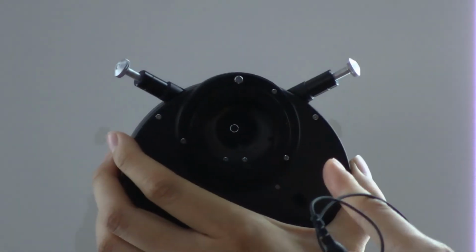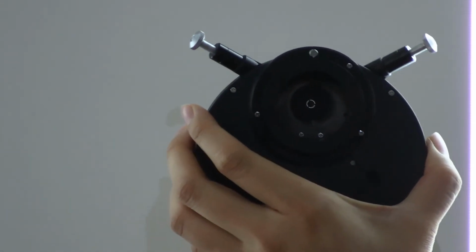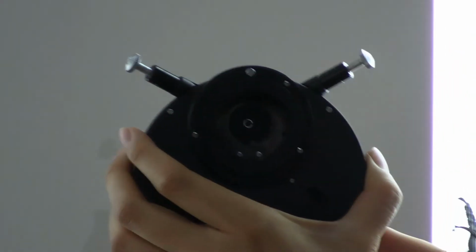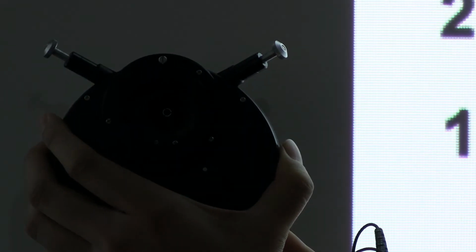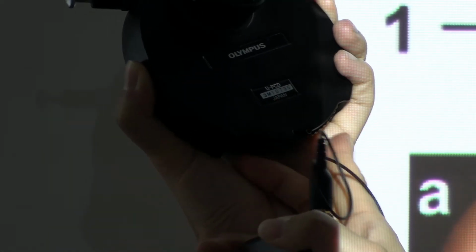And you can see the little ring on the phase 1. So it is the phase ring. Can you see it? Yes. So when you turn a little bit, they have 3 different sizes.